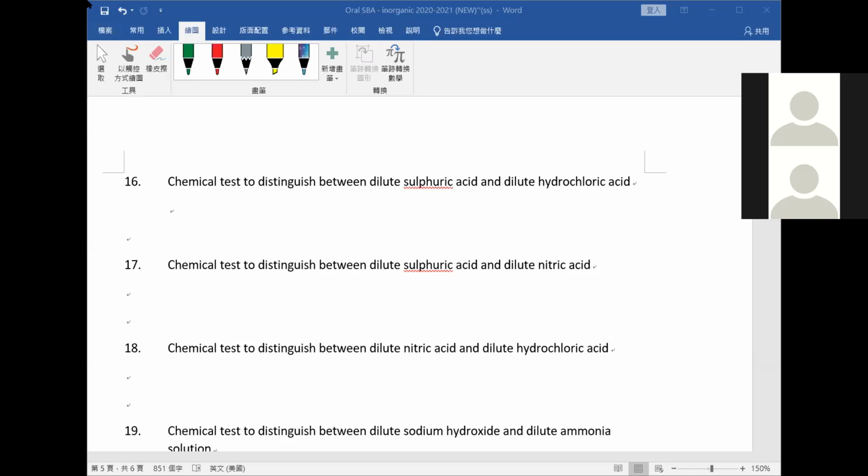What about adding barium, would that work? Barium metal. Wow. Before you add it, you better let me know and wait for 5 minutes because I want to run away from the chemistry lab with my personal belongings. Give me 5 minutes, okay, before you really put a piece of barium metal into it. Oh, I mean barium nitrate. Okay, barium metal, if I put it in, explosive reaction. So barium nitrate.